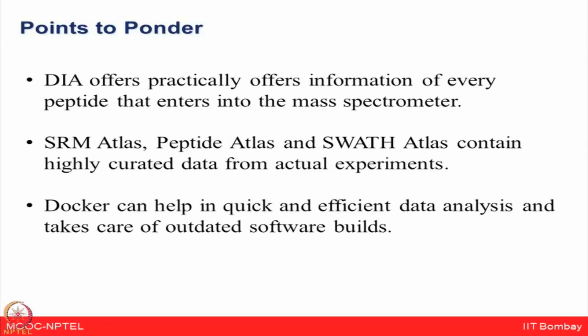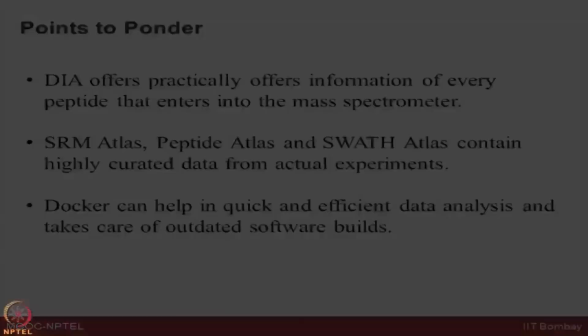In today's lecture, you were introduced to the greater depth and consistency of data independent acquisition, or DIA, method over data dependent acquisition, or DDA, method. Software like Skyline, Spectronaut, PeakView and OpenSWATH require a library for DIA data analysis.